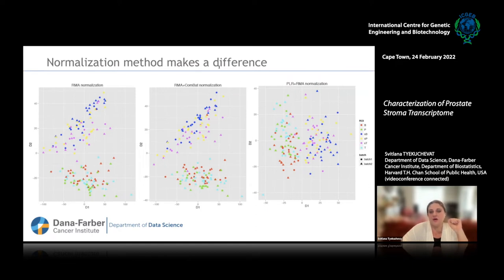It's not the most striking difference that you see. We looked at the ComBat method, which is a very popular and very good method to address batch effects. But here, you can see with the symbols I plot, we had two batches. There is not really a batch effect per se. There is something else going on that doesn't allow us to see the separation between epithelial and stromal tissue. And this, we believe in this data, should be the strongest signal. It is not observed on the first principal component. It's somewhere more like between the first and the second principal component.